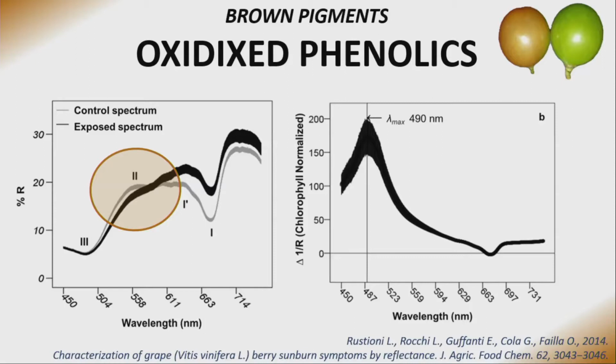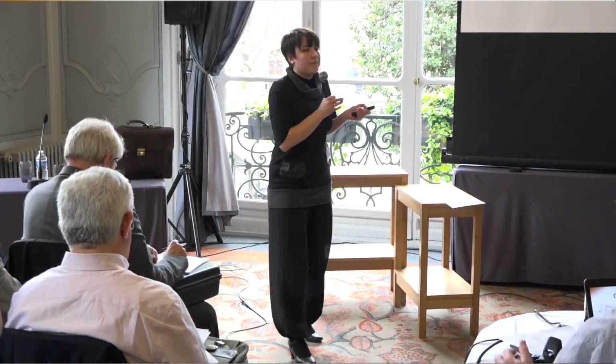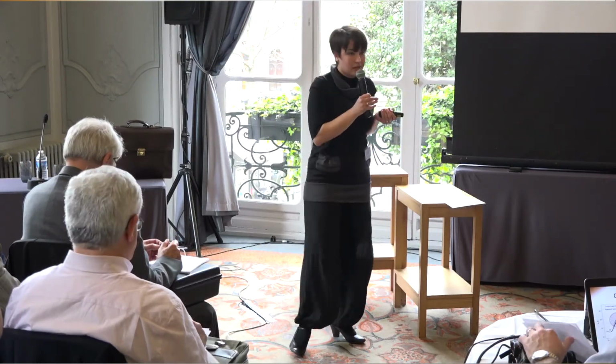And by comparing sun-exposed berries and shaded berries, we were able to see a modification in the spectra in this region. And by the difference between the two spectra, we can highlight the band related to the brown pigments, which are considered oxidized phenolics.